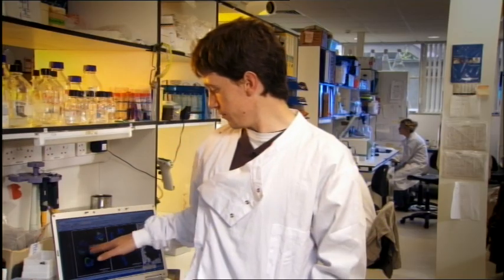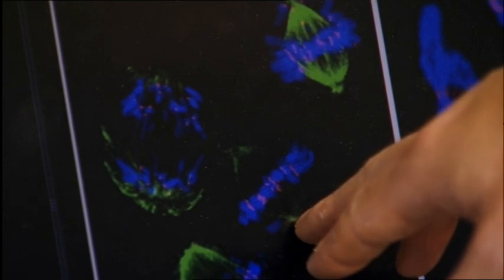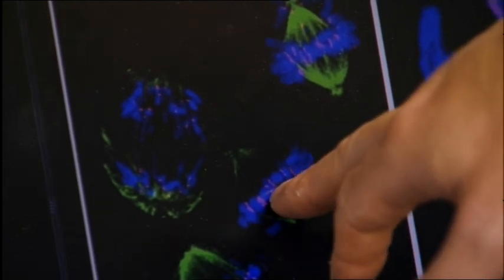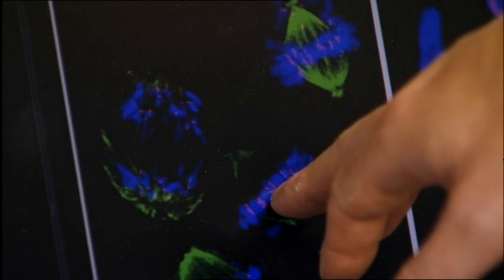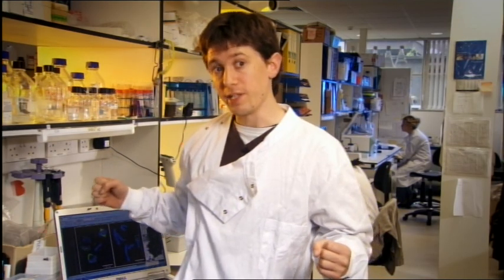You can see it here. The cell makes a copy of its genetic material, and so within one cell it has two copies, but it needs to pull them apart and divide them into two cells. What we have in green, labelled with a green fluorescent light, is the actual spindle — the actual motor that drives cell division. In blue, we have the genetic material, the DNA, the inheritable material of the cell. And in red, we have what's called the centromere. These are the points on the DNA where the spindle actually joins and generates the forces that drive cell division and pulls it apart into two daughter cells.